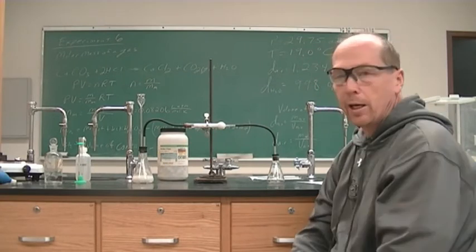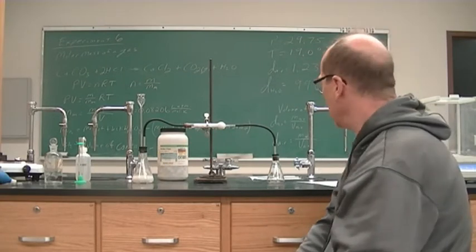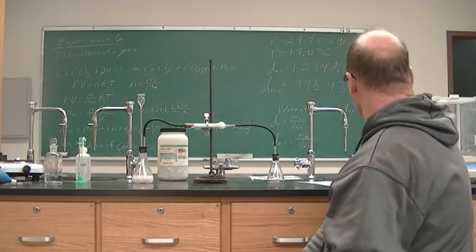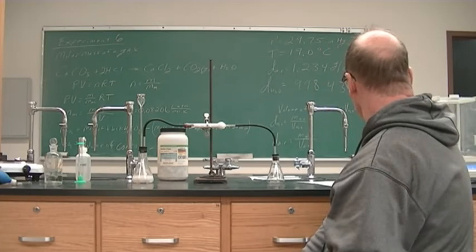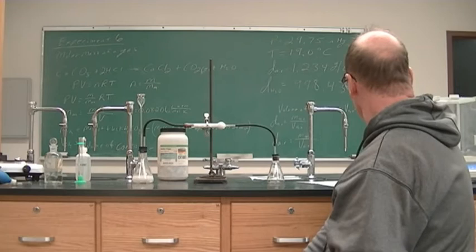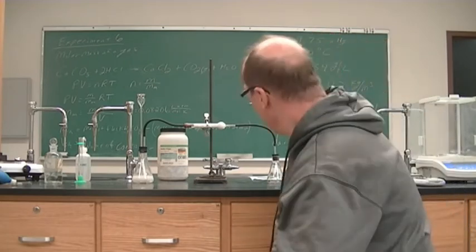As soon as our balance has calibrated and reached zero, I will weigh our flask. I think it's getting close. Not zeroed out yet.